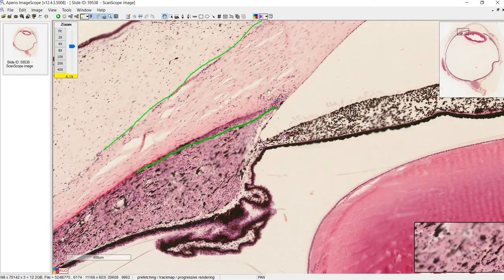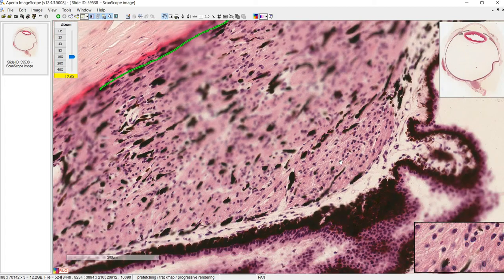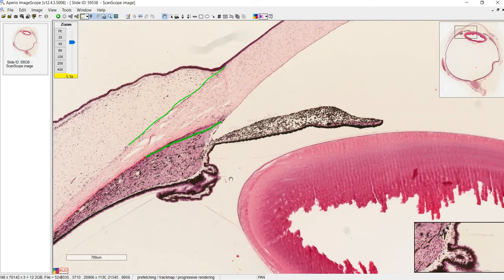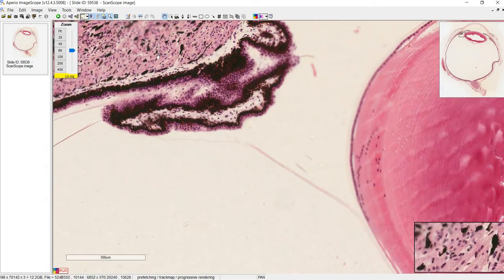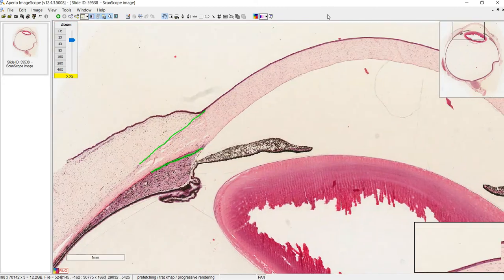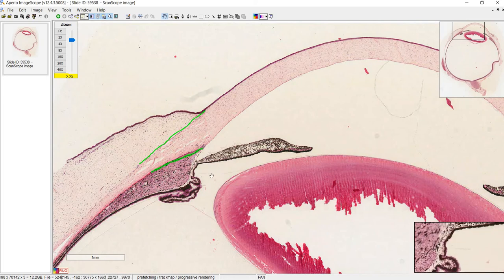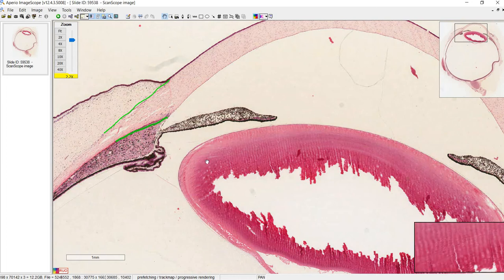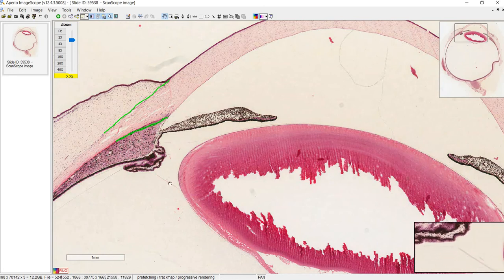Down here we have another structure distinct from the sclera — the ciliary body, which is largely made up of smooth muscle. The ciliary body is what contracts to allow your eyes to accommodate. When an object gets closer, the ciliary body contracts and moves toward the lens, the zonule fibers relax, and this makes the lens thicker and rounder so you can see better. When you're looking at something far away, the ciliary body relaxes and moves back outward, tightening the zonules and stretching the lens thinner.